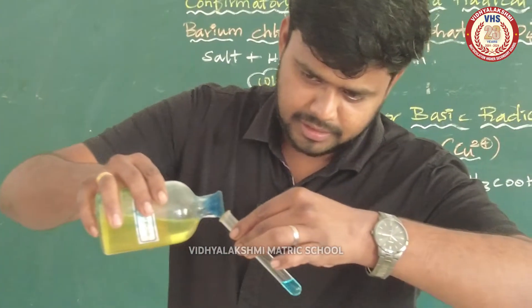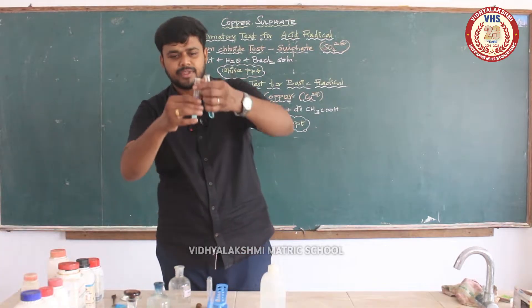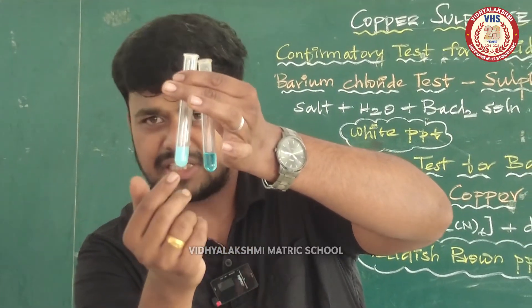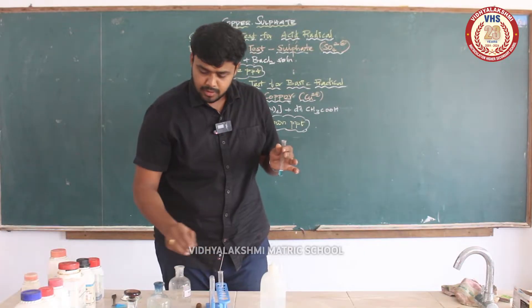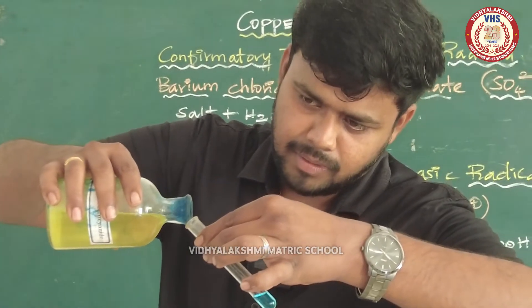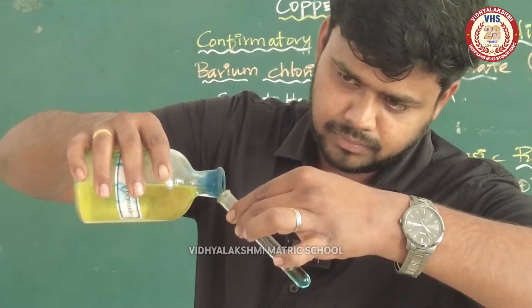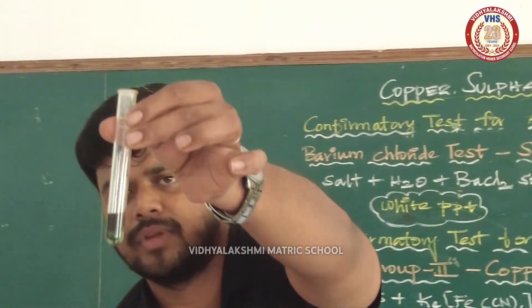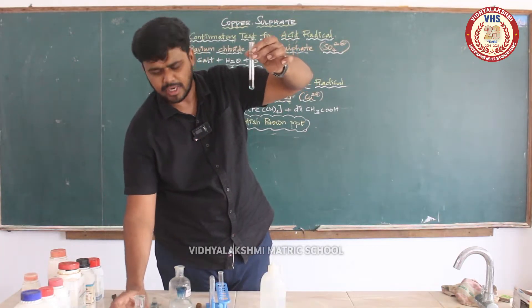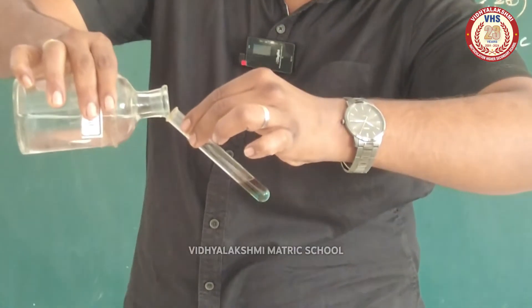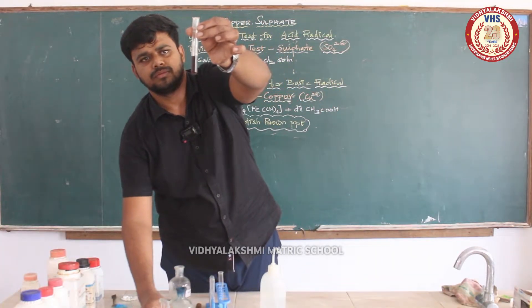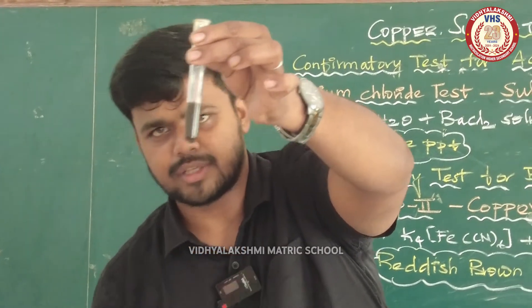There is a blue color solution. You can see the same color naturally. In this case, we have to test a different color and change to white color. This color is copper. Adding potassium ferrocyanide to copper gives a reddish brown precipitate — this is the confirmatory test for copper sulfate.